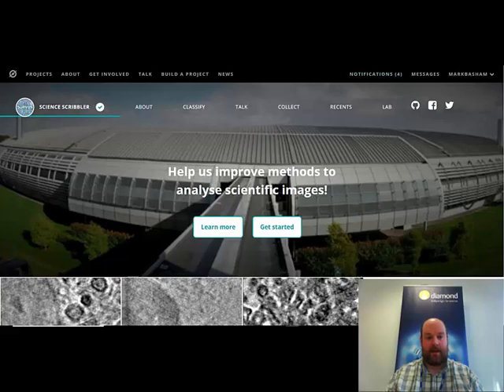Science Scribbler is developed by Diamond Light Source and it's a project that's trying to help us analyze some of the imaging data that we collect. The data we're going to start out looking at first is cell biology data from the B24 beamline. So potentially very interesting research in things like medicines and also understanding of diseases.